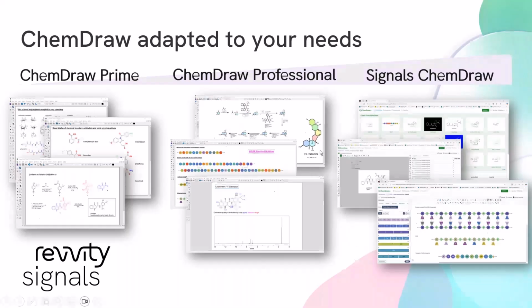There are three basic offers for ChemDraw. The first one is called ChemDraw Prime. This version of ChemDraw is the basic chemical drawing editor designed for chemists who want to create publication-ready drawings rapidly. Then there is ChemDraw Professional, which is actually ChemDraw Prime with chemical intelligence, property prediction, viewing capabilities, and also integration to some scientific databases.